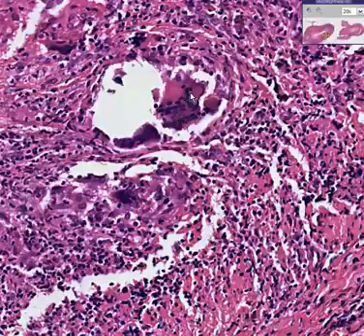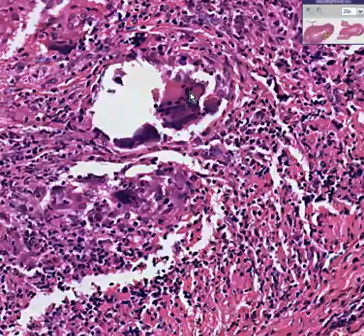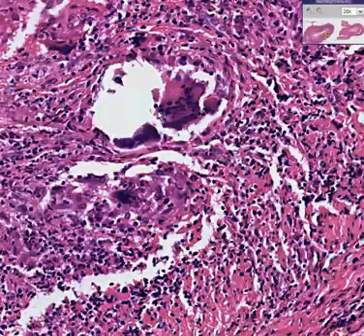It's almost always associated with an extremely high erythrocyte sedimentation rate. It also may involve the major arteries of the eyes, so clinically, blindness can be associated with this disease as well. Giant cell arteritis, aka temporal arteritis.